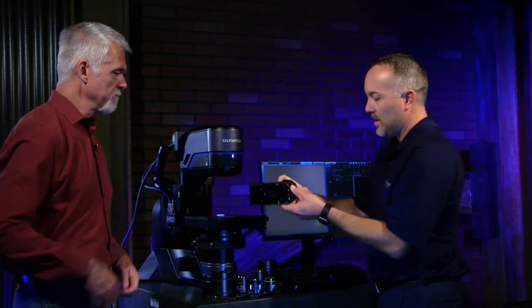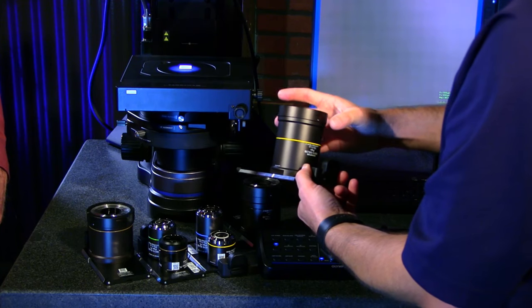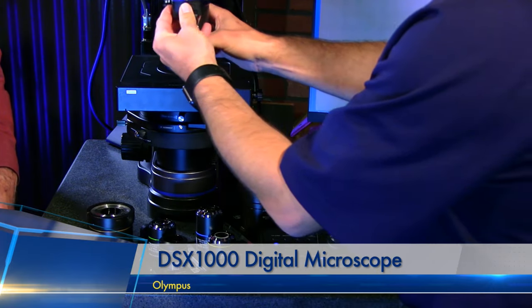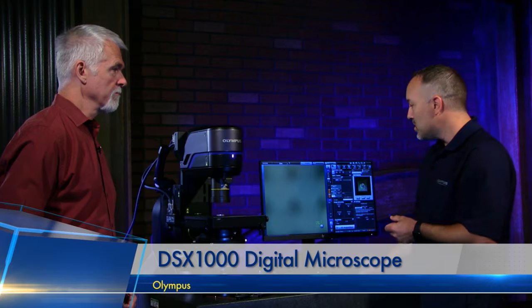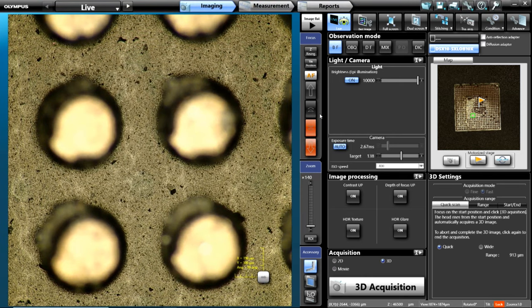Maybe we want to switch to 10x magnification — our 10x objective here. This is a large objective. The reason for the size is it not only allows lighting down the center, but it allows lighting around the outer edge as well. The distance here is still super long working distance. As I put this in, we're still quite far away from our part, so we can still have a part with a lot of texture but with increased magnification. All the optics — long working and super long working — are all parfocal. So I can just move to the focus position and it brings us right back into focus.